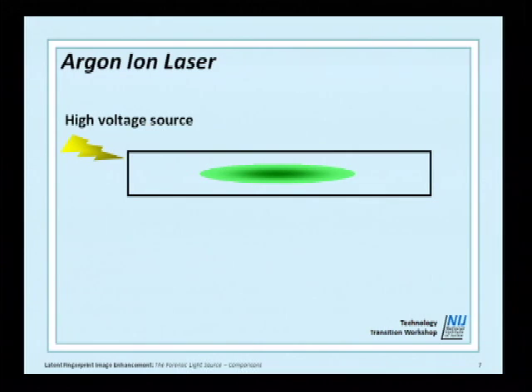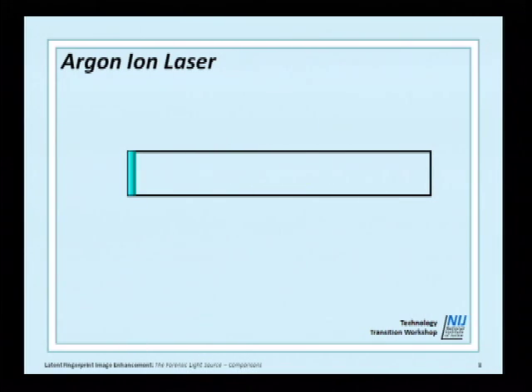And in this tube, you have mirrors at either end of that tube. The one on that side is virtually 100% reflection. Very, very high efficiency. They have to be cleaned. They have to be maintained, and that's where the instability part came in. And the other one is 12% transmission.